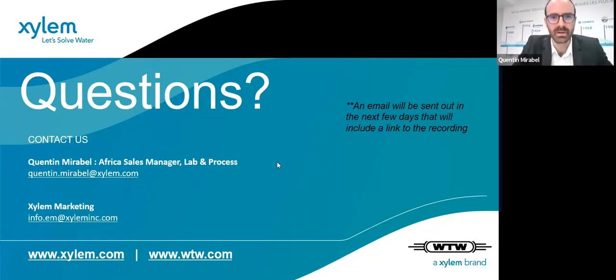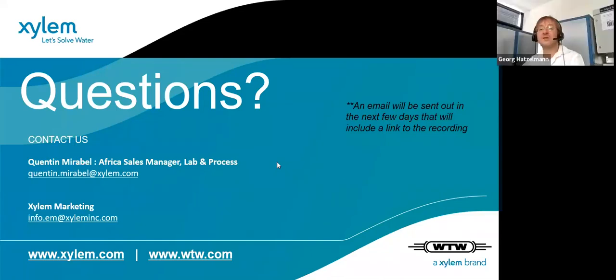Another question about COD: which organic compounds are not able to be detected as COD? A customer in the chemical industry, wastewater application, seems to have not much of a reading compared to DI water. If I understand the question correctly, it's whether the carbon compounds are absorbing similar to DI water.